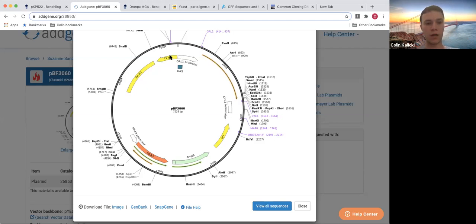So you have a couple origin sites there. This is transported in E. coli. If you ordered it from Addgene right now, it'd come in E. coli for you. You would start your cultures, and they would start making this based on this ori site here. But then we wanted it in yeast. But yeast doesn't recognize this site to start replication, so you need a second origin.